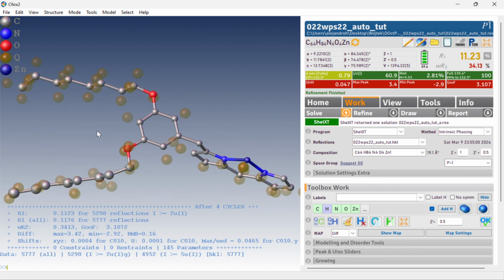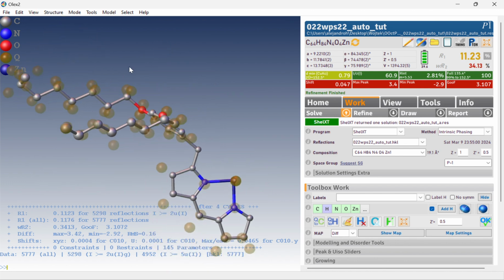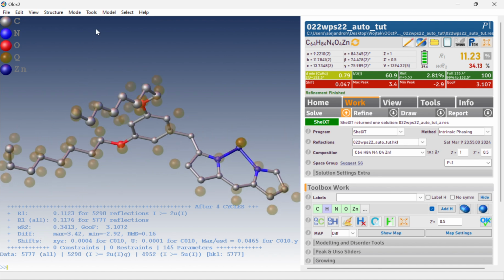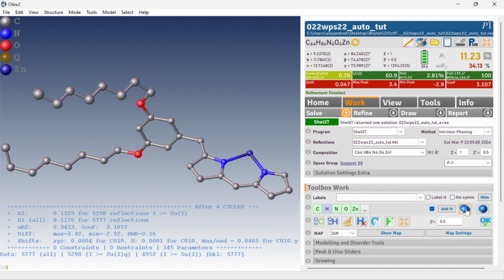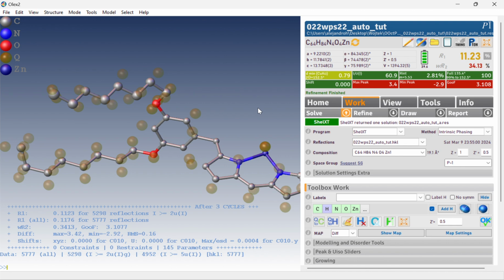As you can see already, on the electron density map we have a lot of peaks which are in the positions where the hydrogen atoms should be, so it actually looks pretty good, right? But hydrogen atoms we will do later. What do we want to do now? If we scroll, we are getting rid of these Q peaks, electron density peaks. So now, if we click here, or just type anis, and click refine, or do Ctrl R, I'll do Ctrl R, we are doing an anisotropic refinement.